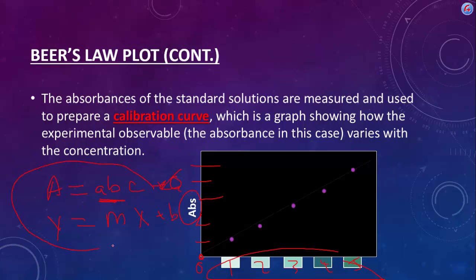So really, we have the slope of a line that intersects 0 that we can get from a Beer's law plot. And the slope here does correspond to those two things here, the cell path length and the molar absorptivity coefficient. And that's what we can use to basically find unknown concentrations in the future. So if I were to measure an absorbance right here, again, I could go over to my line here and say, okay, and go down, and I can find what the concentration is. Or you actually plug your absorbance into the equation and solve for the concentration. So that is Beer's law and spectrophotometry. Come ready to be using this in some upcoming labs.